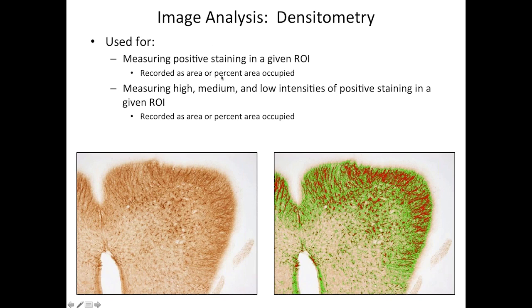Now, volumetric calculations, like I mentioned before, there are a few different methods that come into play with this type of analysis, depending on budgetary constraints and what you need for your particular study. So the three methods that we use are the ellipsoid method, Simpson's rule, and a fairly new plugin offered through Fiji, the voxel counter.